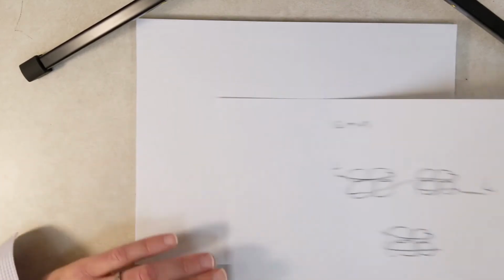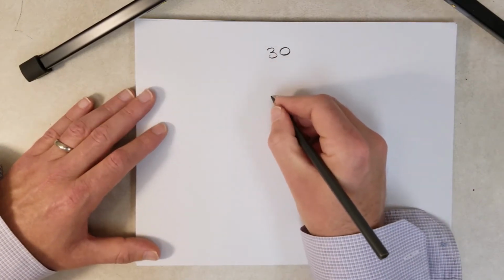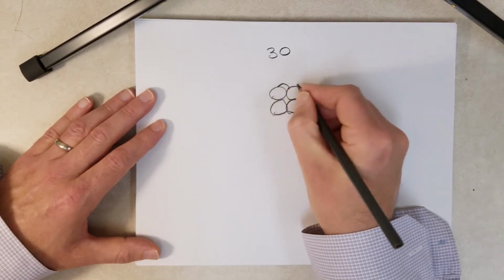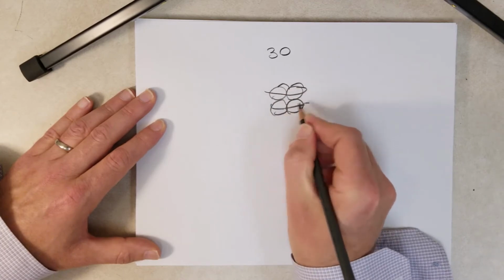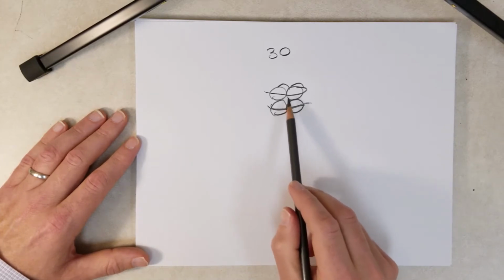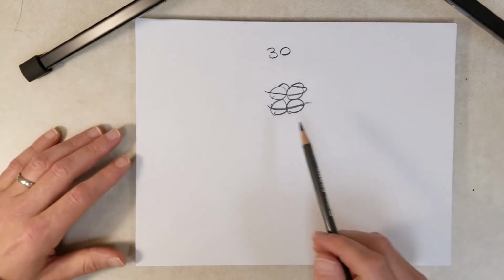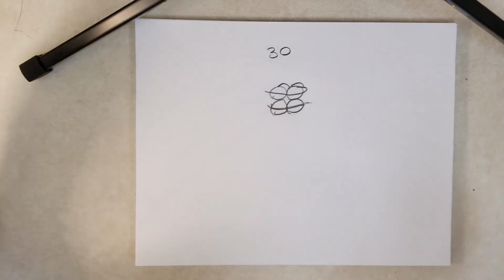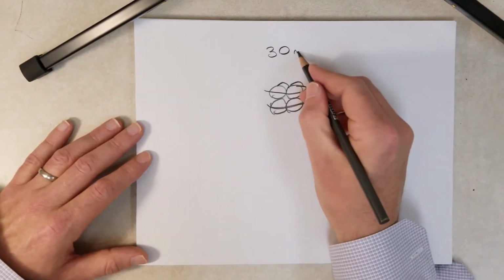And maybe after 30 minutes or 45 minutes or an hour or whatever, micrococcal nuclease has enough time to wedge itself in between all the nucleosomes and get to all that linker DNA. So all we're left with is the DNA associated with single nucleosomes. So we have millions of single nucleosomes in a tube of chromatin that has been completely digested into single nucleosomes. All the linker DNA is gone. Let's say this is like 30 minutes.